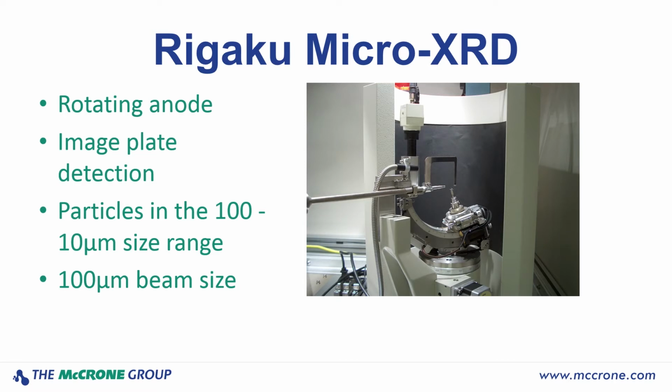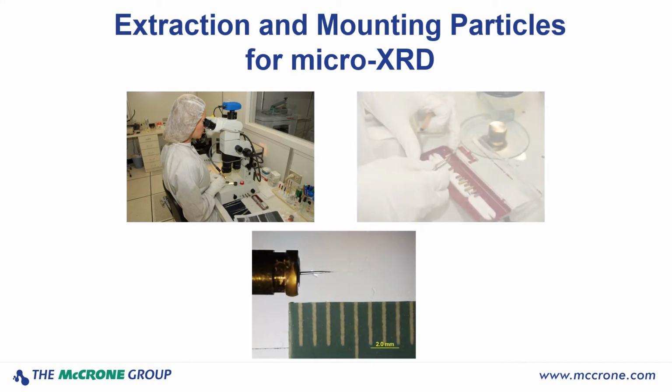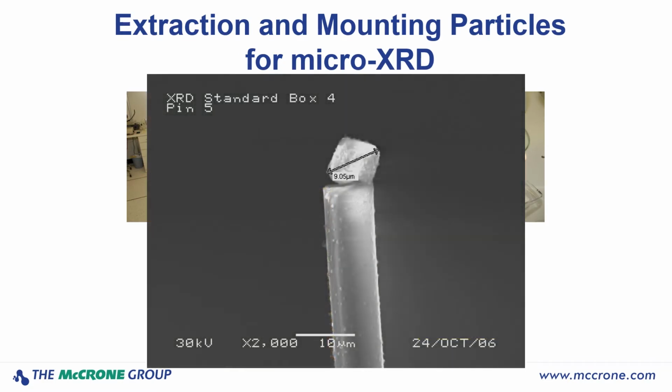So now that we have this instrument, we utilize our exceptional clean room for extraction and mounting particles. Our clean room can extract particles for various techniques, but also can mount them for XRD. For XRD, for particles, the clean room can draw out fiber optics to the size of about 5 to 10 microns for mounting of small particles. And here's an image of a tungsten needle mounting a particle onto one of these thin glass fibers.